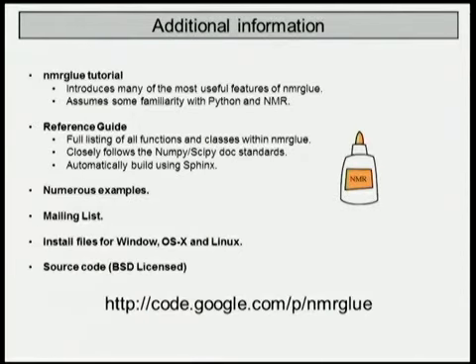So if you want additional information, NMR glue is hosted at Google Code. The actual source code is on GitHub. There's a tutorial, a reference guide, more examples.